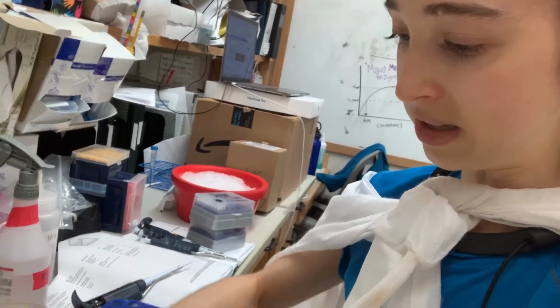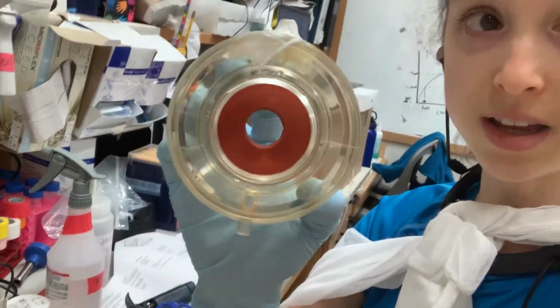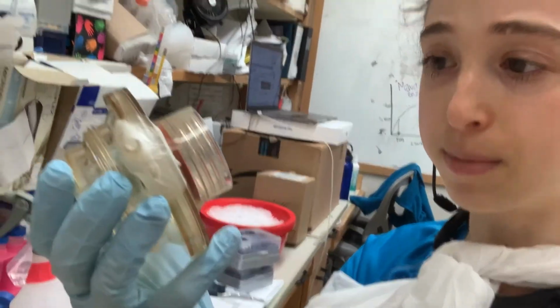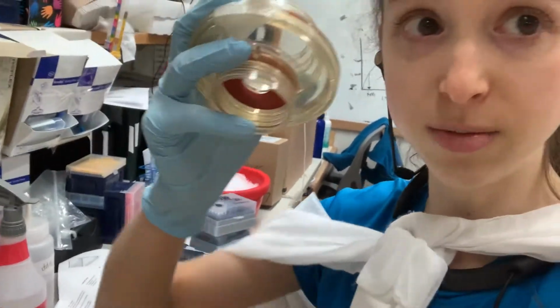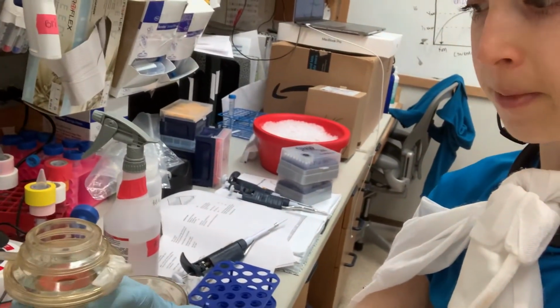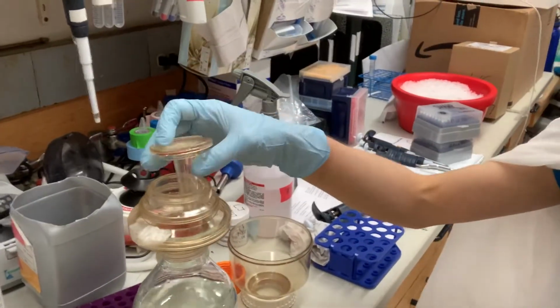Basically this part has this rubber gasket. Make sure it has the rubber gasket on it. Our old rubber gaskets broke, and apparently you can't just buy the rubber gaskets. So we had our machine shop make rubber gaskets, but they're a little too big, so it's kind of hard to get the right seal. But this part screws on. Then this goes in here.